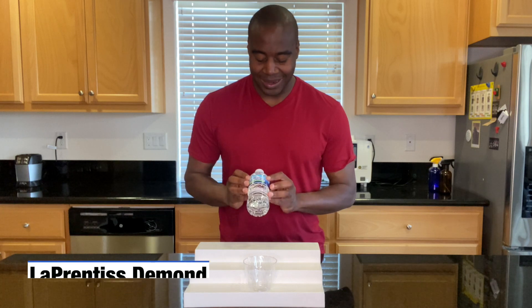Hey, what's going on? I'm LaPrentice DeMond. In today's video, we are going to do a pH test on Ice Mountain spring water.